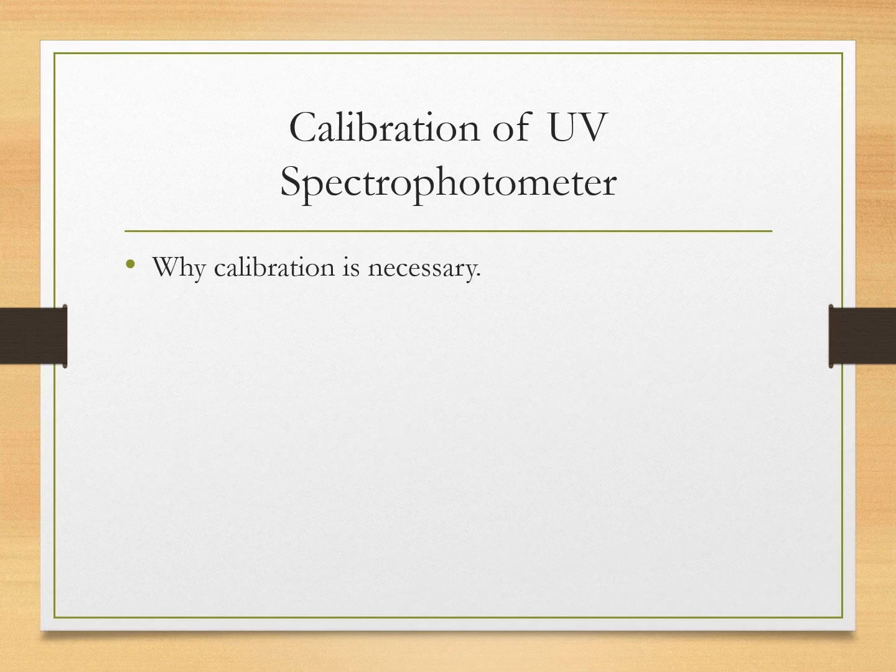So standards are used to ensure that accurate measurement is performed. If we pass a sample of known measurement, the result will be known, and if the result has some error, then it will be detected that the instrument is not working properly.